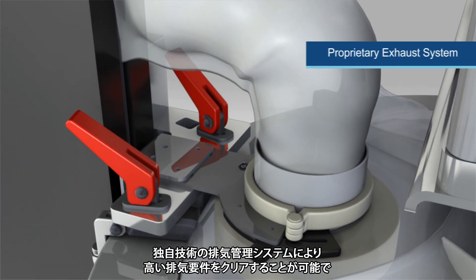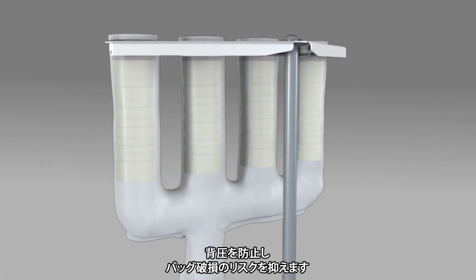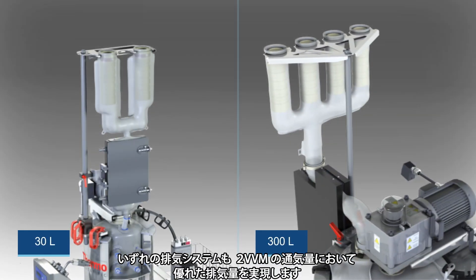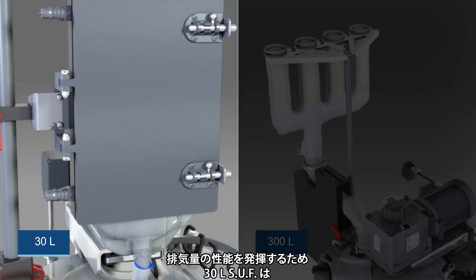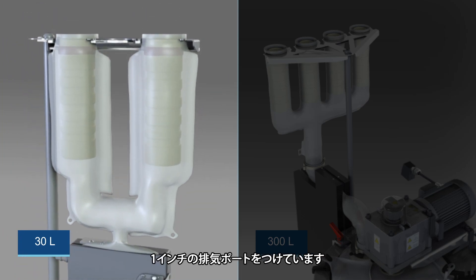A proprietary exhaust management system enables high gas flow requirements to prevent bag pressure and helps minimize the risk of bag failure. Both exhaust systems provide superior performance at 2 vessel volumes per minute. The 30-liter SUF accomplishes this by using a 1-inch exhaust port attached to a high-flow filter bag that can be configured with up to 2 filters.